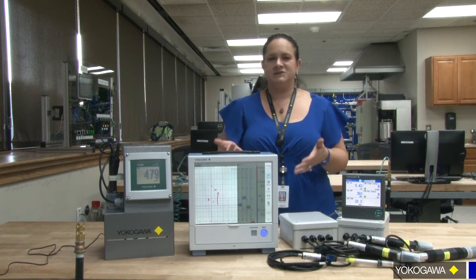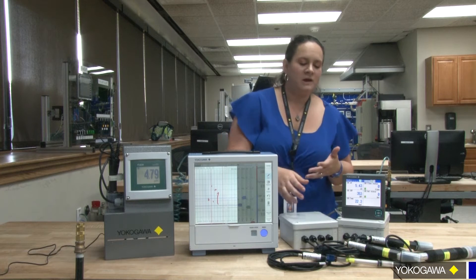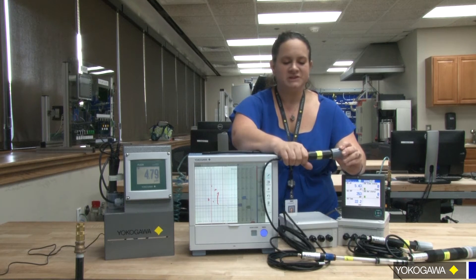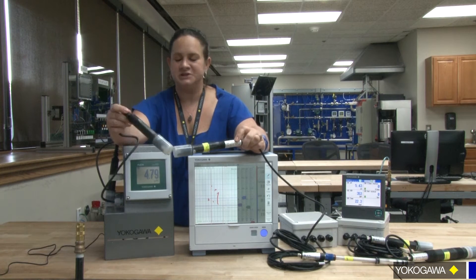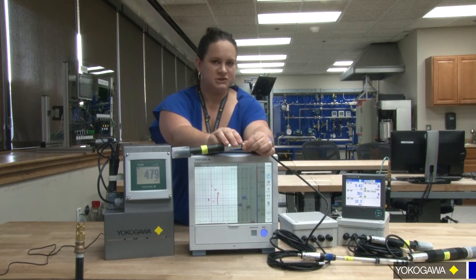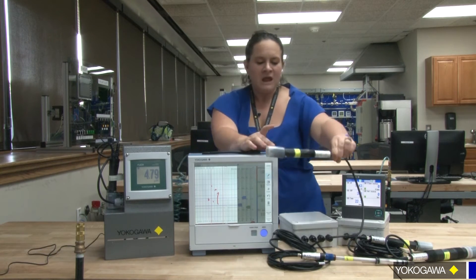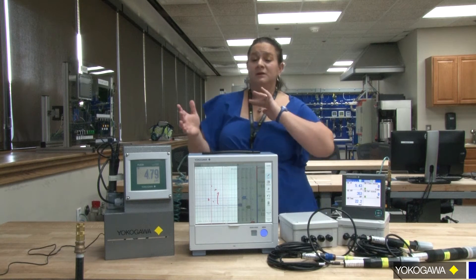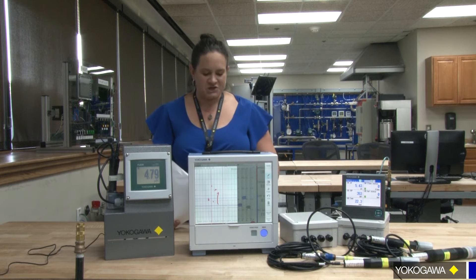This entire time I've been talking about these digital sensors like you know what we're talking about. So just in case you don't already know what a digital sensor is — we call our digital sensors CENCOM, sensor communication. It's your traditional analog sensor — you can see this is the exact same sensor as this. The only difference is this top portion, which is a mini microprocessor. It's basically taking the analog signal it reads and converting it to a digital signal. Everything that you used to have in your analyzer is now in this little sensor chip on the top of it. This allows you to no longer calibrate out in the field — what used to take you 20 to 30 minutes, depending on how intense, if you have to suit up depending on your area classification and environment.